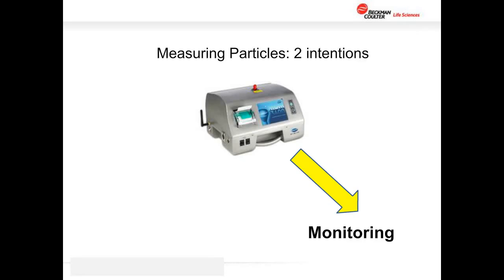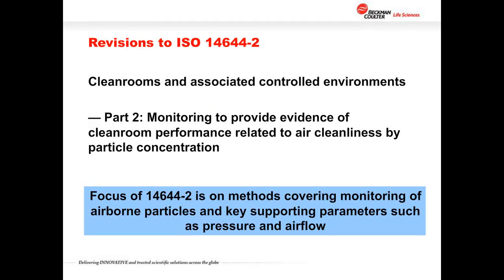So this is a focus on the other side of particle counting, and this is focusing then on the monitoring side of it. What do we do day by day or week by week to look at an area and understand it's still appropriate for our use? So the title of this is Monitoring to Provide Evidence of Cleanroom Performance Related to Air Cleanliness by Particle Concentration.